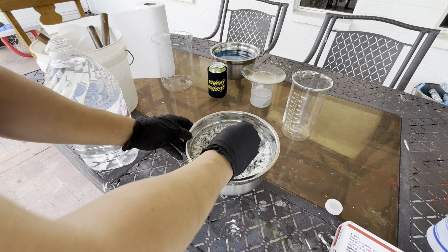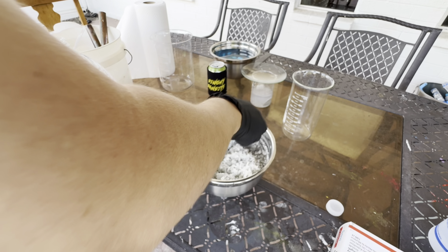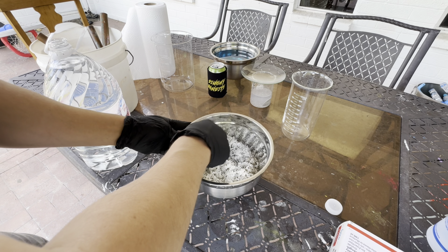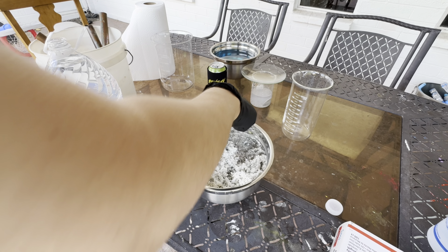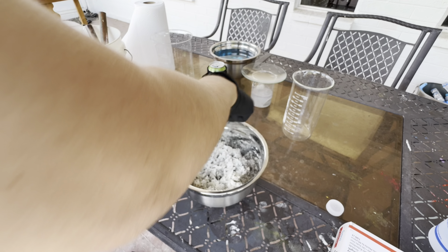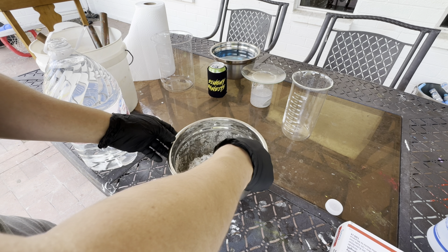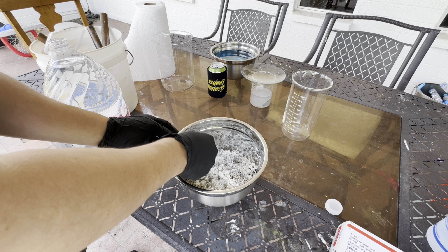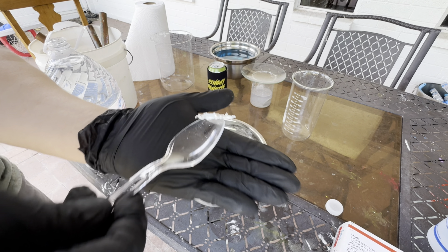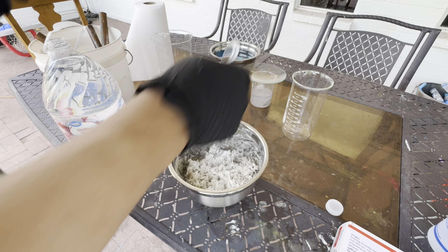Crack this distilled water open, get a spoon and we'll just scrape the edges of this bowl off. Yes, this does break some of the crystals up, but you can't really avoid that. Look at these shards, man — this is quite epic. I've done several silver cells, but that thing, man.